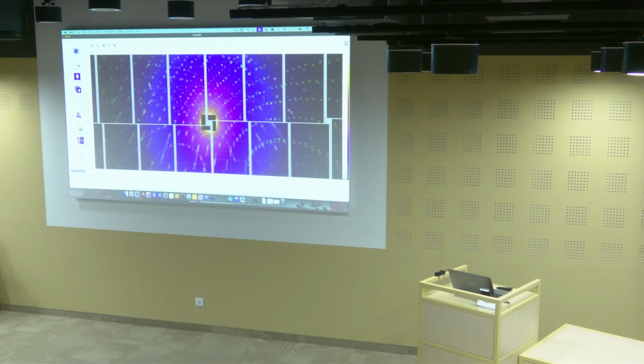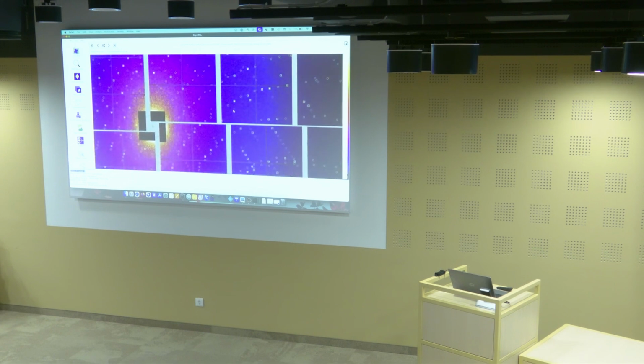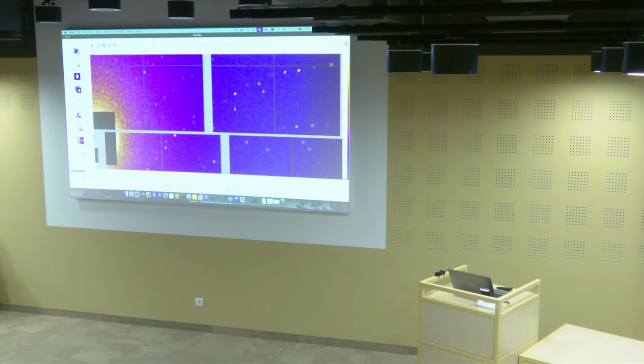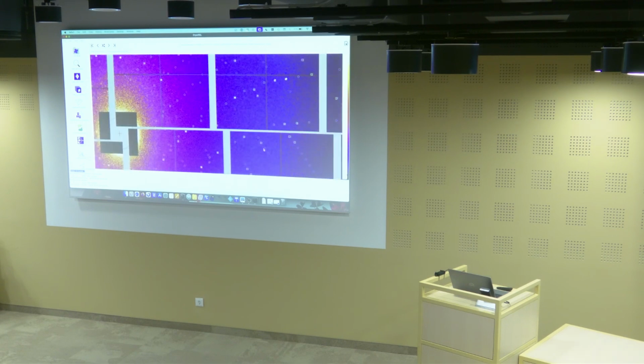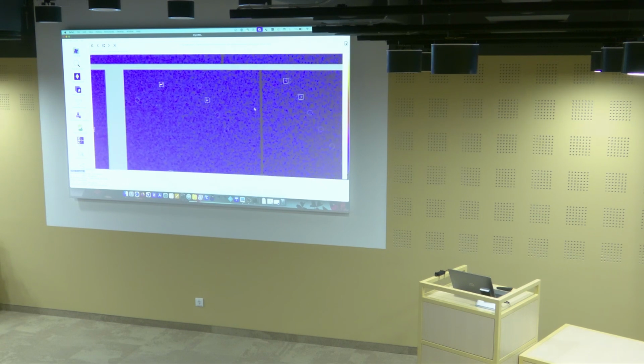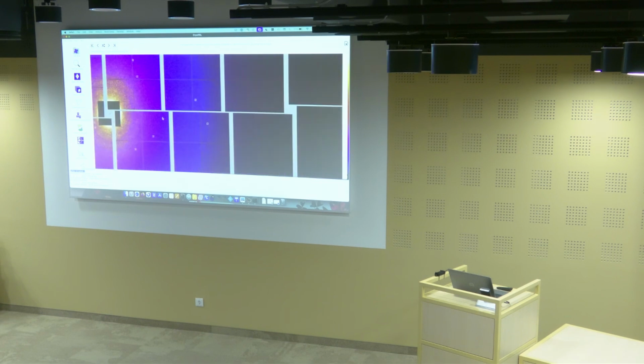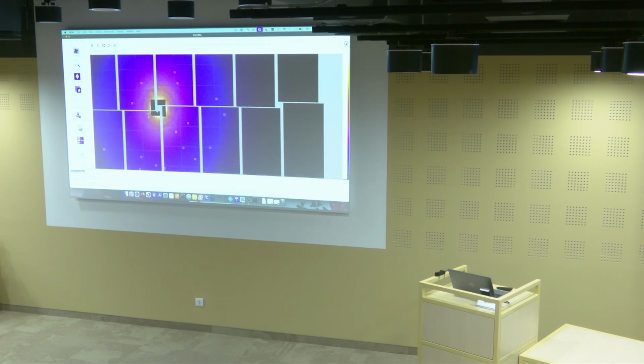But overall, the locations that we have selected fall between the predicted positions. For example, here we can see that certain positions which might be other spots are also predicted, so that's good. Actually, this is not too bad. We can see that this was one of those peaks that we selected. This one we did not select, but it's also predicted. So that's actually a good sign. Now we can go to another image. I'll zoom out a bit. Do this again for every image, but if you have millions of images, you basically don't want to do that for every image manually.